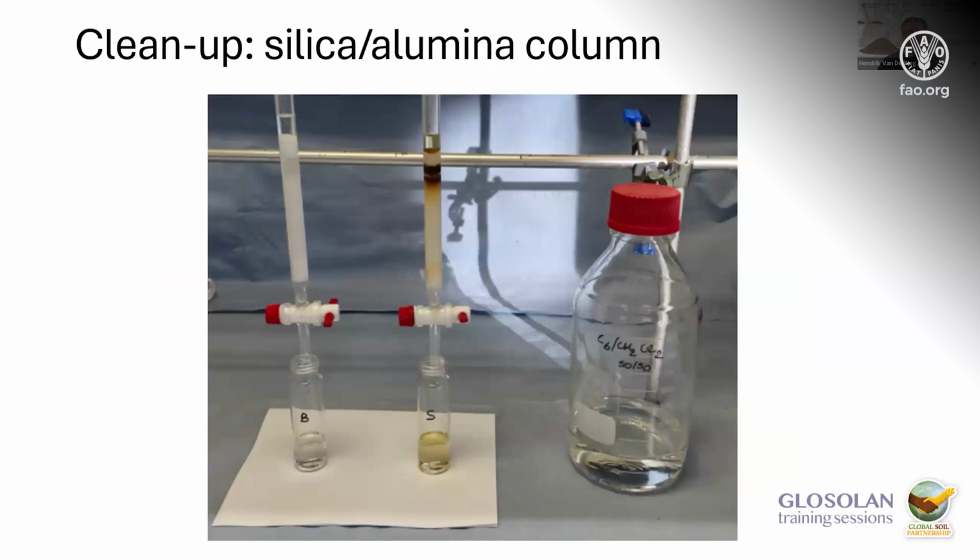I will go more in detail right away, but this is in fact a picture of a cleanup where you can see that the sample, a lot of these interferences are trapped on the column and the final extract is cleaned. I don't know if there are already questions now about the extraction before I go to the cleanup.